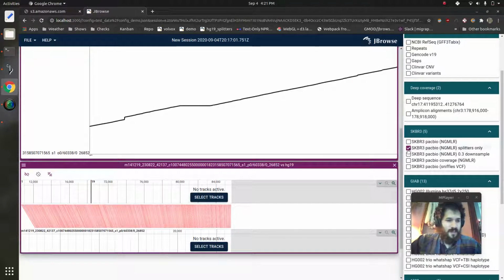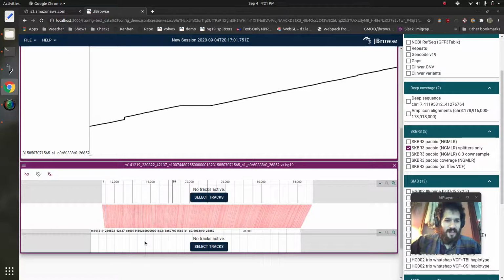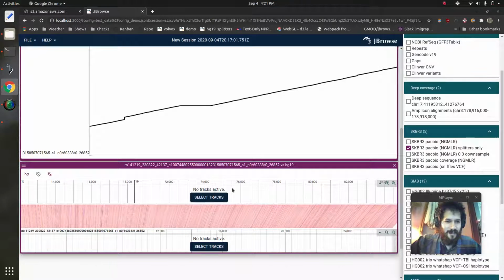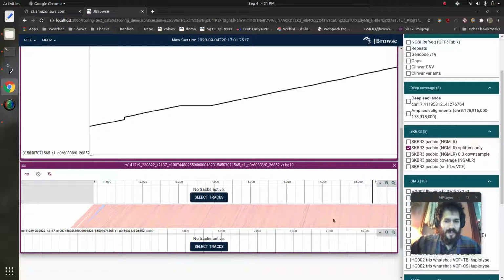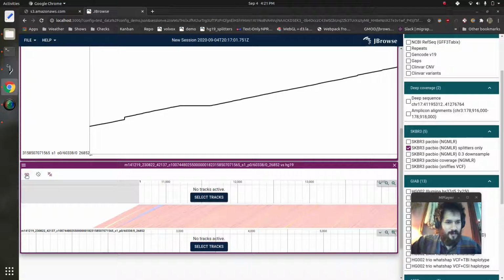We can also see that same type of info if we look at this synteny view. And currently, to navigate the synteny view, you kind of have to go pairwise. Actually, there is a cool thing we can do. We can link the two, so when we hit zoom in, it zooms in both at the same time. So that's kind of a nice feature. Let's zoom in again, and maybe we'll unlink it so we can straighten out these polygons.